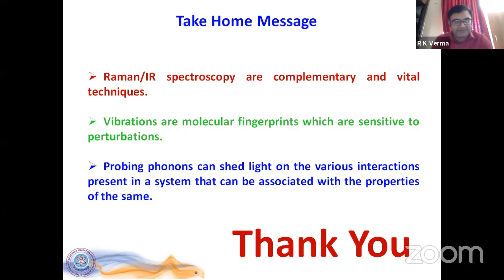There is a question from Chandni Bhatt. She is asking, what kind of change should be expected in the Raman mode when a nanostructure semiconductor material is doped with N or P type dopant, except shifting of the Raman mode peak?